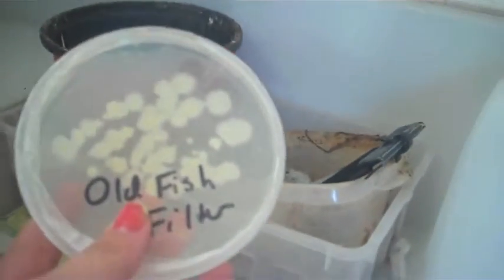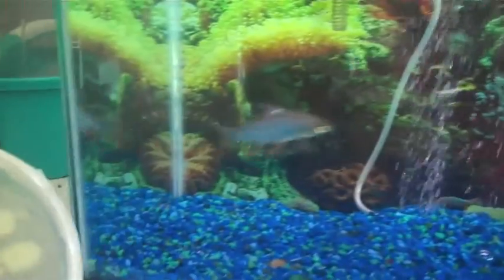Today we're doing Gram staining. For our petri dish, we swabbed an old fish filter. Now we can start Gram staining.